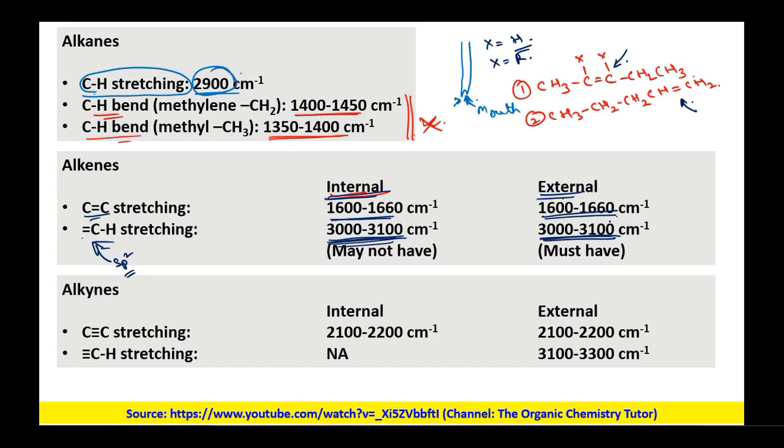Once you have analyzed that you are getting a peak at 1600 to 1660, you can confidently say that C double bond C stretching is there.